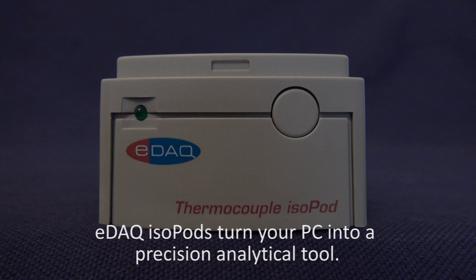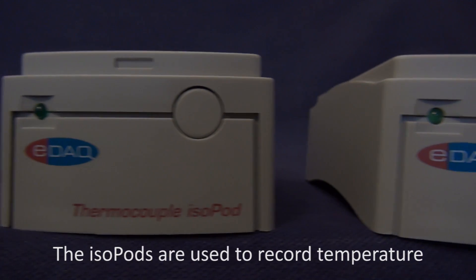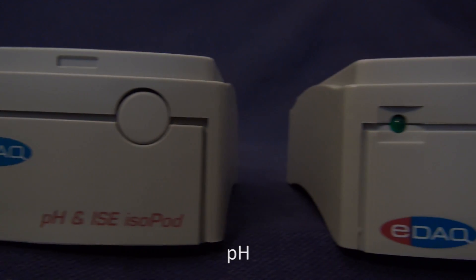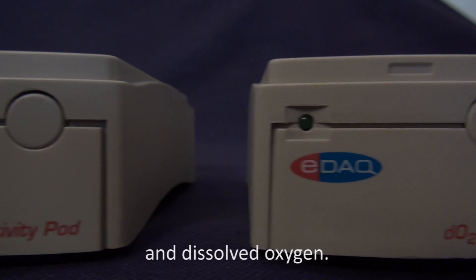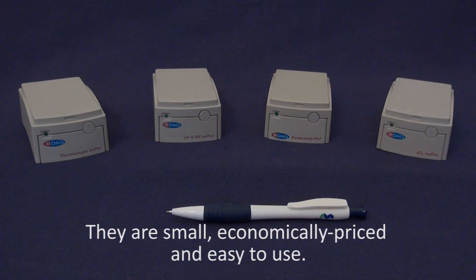EDAC isopods turn your PC into a precision analytical tool. The isopods are used to record temperature, pH, conductivity, and dissolved oxygen. They are small, economically priced, and easy to use.